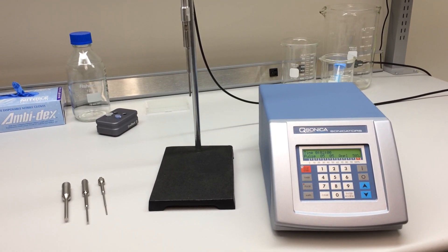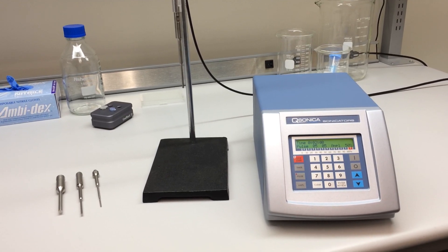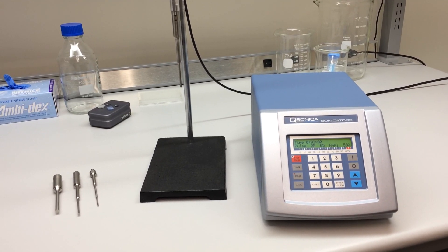If your application requires processing samples in a wider volume range, you may want to consider a Q500 or Q700 sonicator.